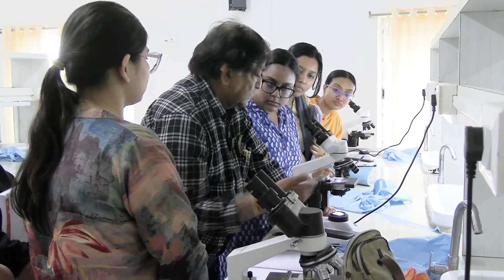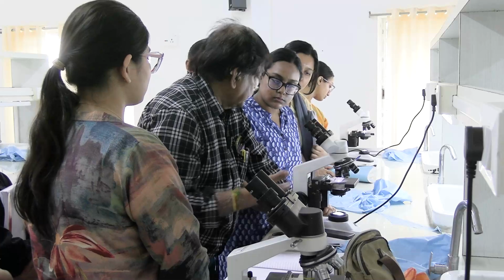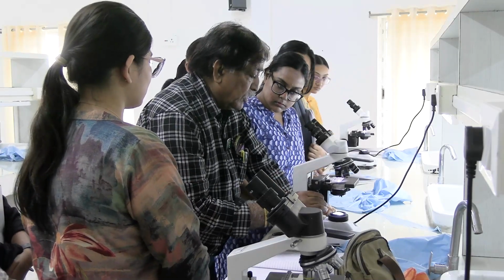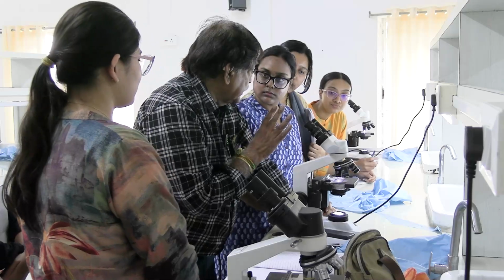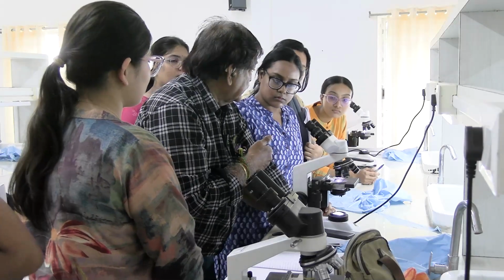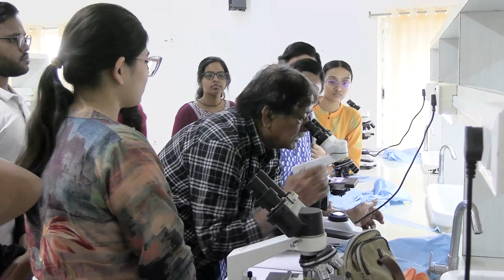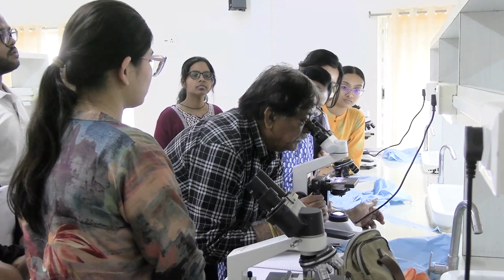You don't touch any other thing like the stage. In the examination hall don't touch. It will be fixed by our professors or whoever is there. He will just fix it so you can understand.